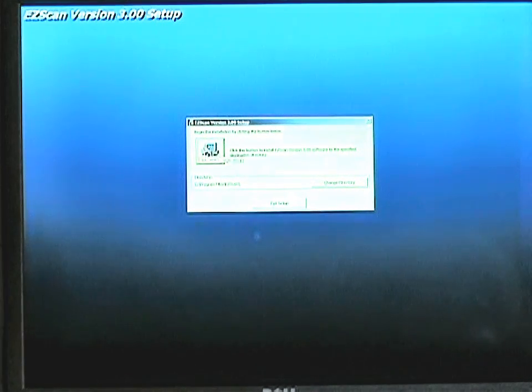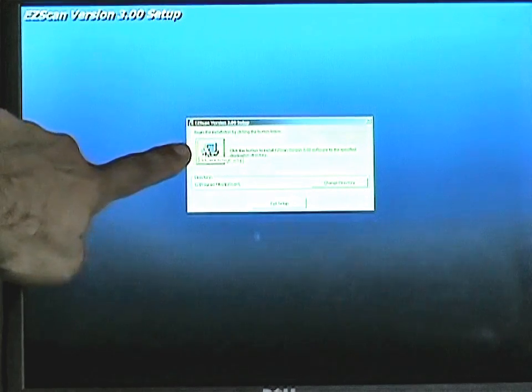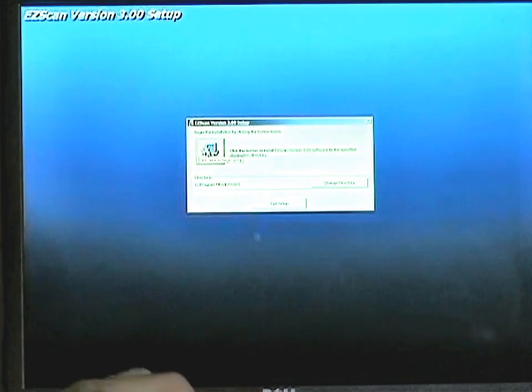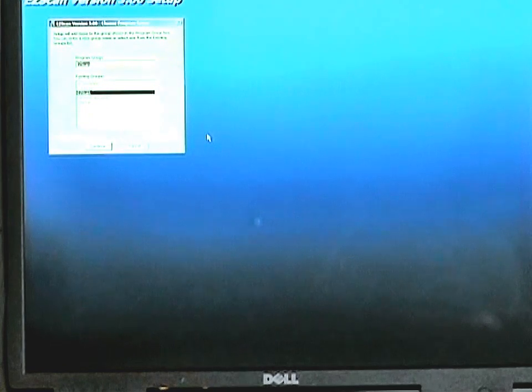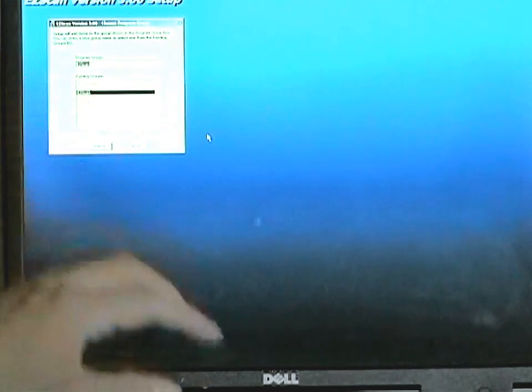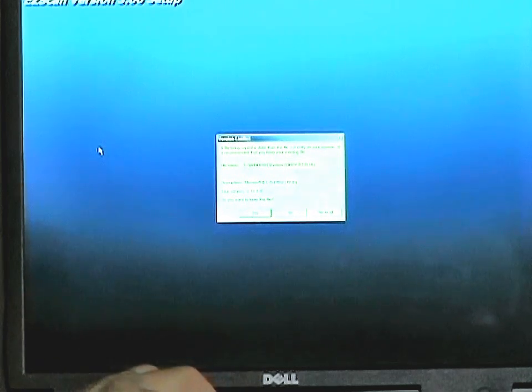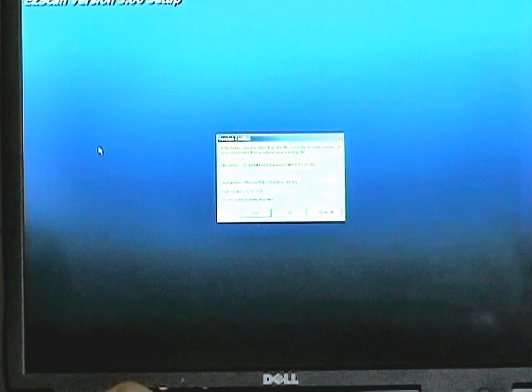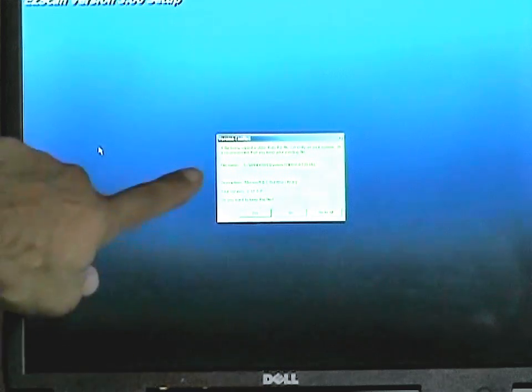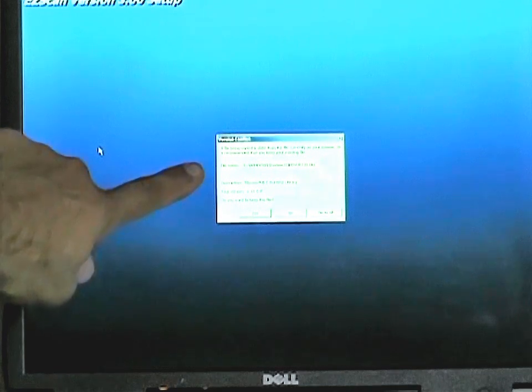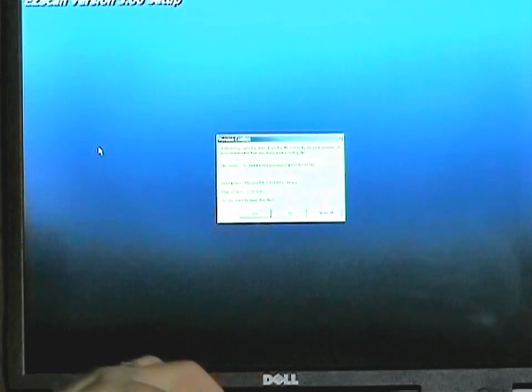Then position the icon and the cursor for installation of the Easy Scan. Select Continue to create an Easy Scan group for your desktop, and the system will load and install the files. Due to the nature of certain Windows operating systems, you may find duplicate files being installed. It is recommended you keep the current files or the newer files on your system.